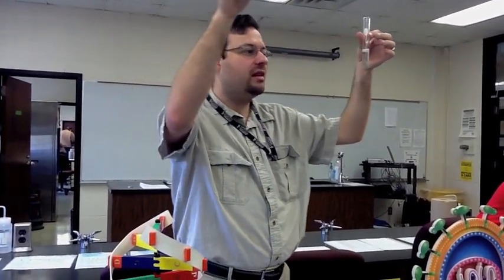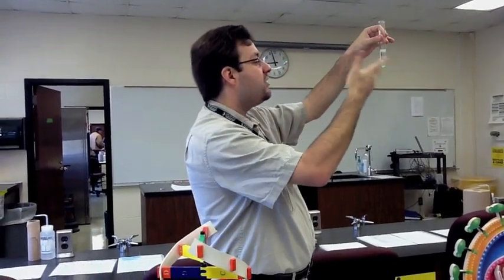That's breaking the cell walls. We were separating the DNA, but specifically what they're going to be asking for on the test is that you're breaking the cell wall. Now, once we got it in here, what was the first thing we added to it? Soap, or dishwashing liquid, Dawn soap, however you want to say it. What was the purpose of the soap? It breaks down the nuclear envelope, so that it releases the DNA out into the solution.